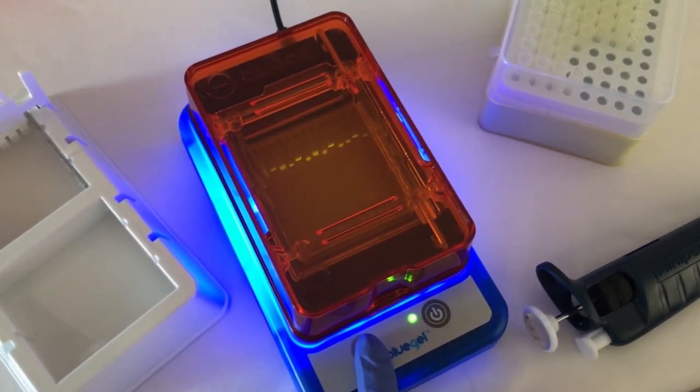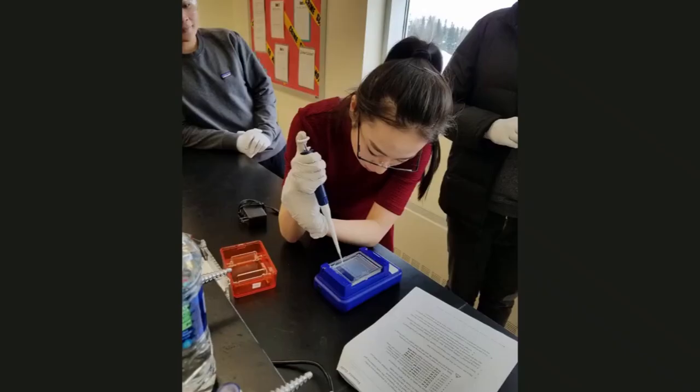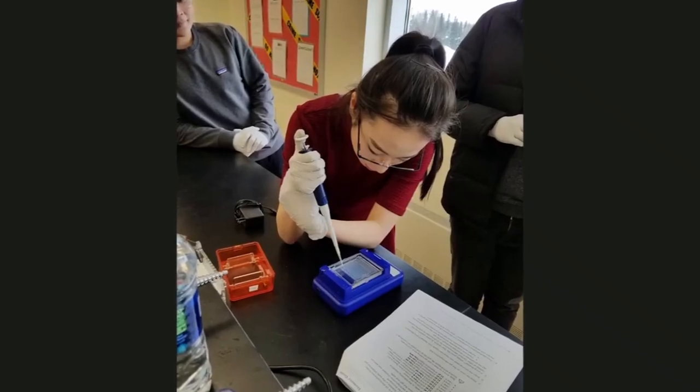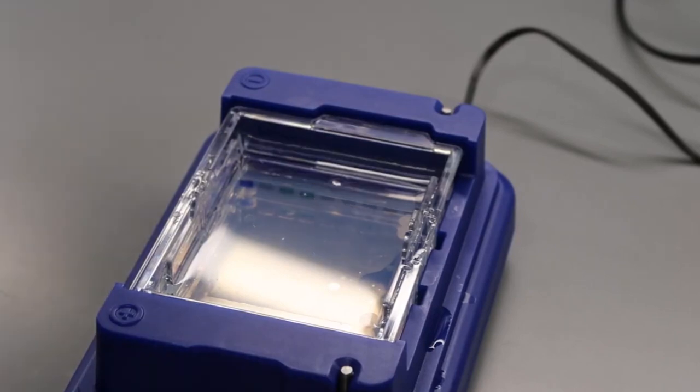BlueGel is fast, safe, and simple to operate. It gives clear, bright, easy-to-interpret results, making it great for anyone from students and beginners to advanced molecular biology users.